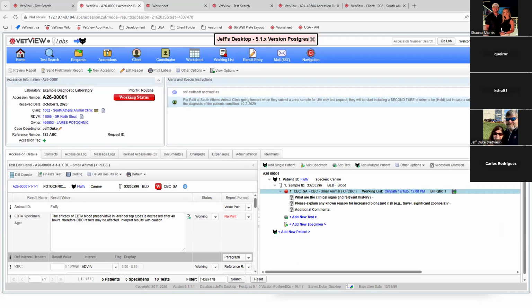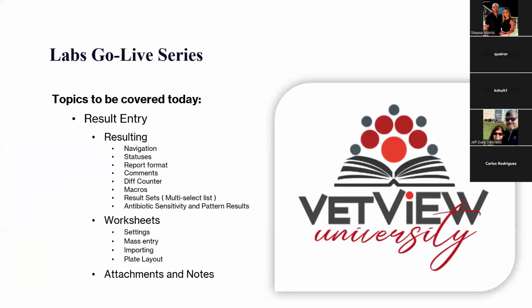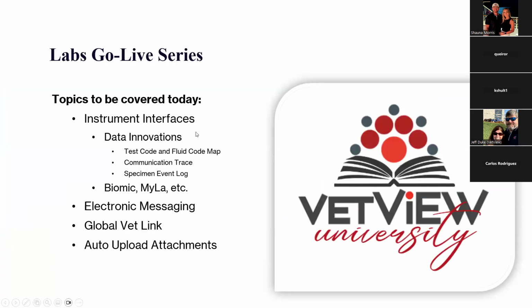Now, that being said, let's jump over to the third section for today, which is on actual interfacing and electronically getting things back and forth from equipment. Obviously, that's where we want to go. That's going to be the most efficient and cut down on errors. So the first thing to talk about is instrument interfacing itself. So in that view, going back over here.